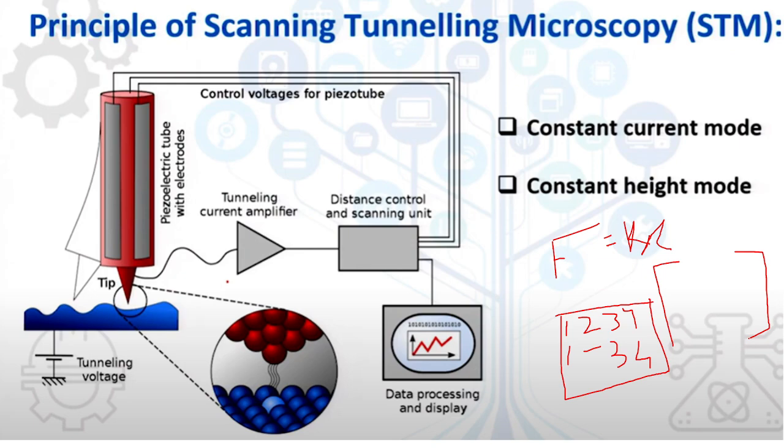If it is just a white and black image, that means from where you are getting the signal, you designate as a 1, and from where it is not getting any signal, you designate as a 0. So 1 0 1 0 1 0 in that way. And after forming that matrix, through software you generate an image. So that's why the image is processed.